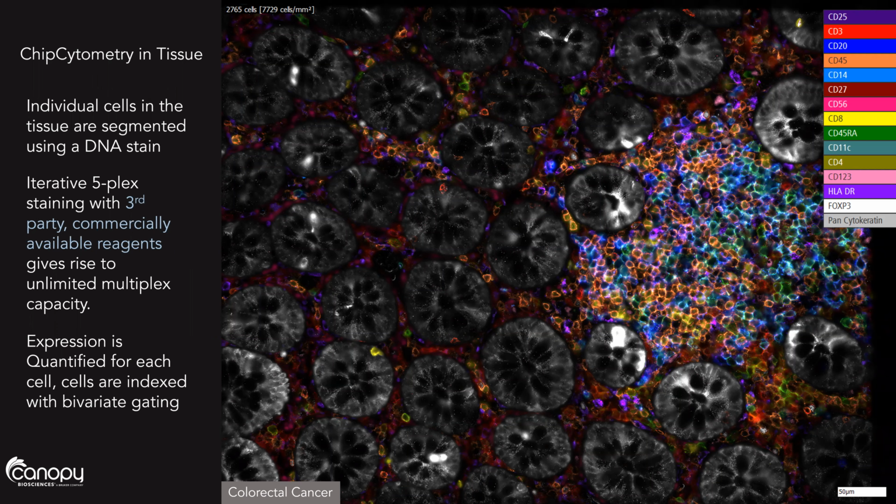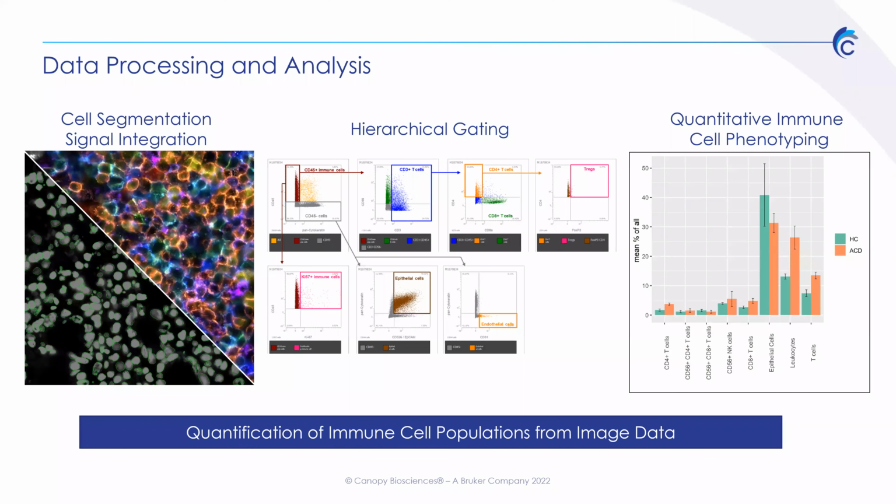The next half, after we've collected the data, is that we use cell segmentation and a DAPI signal in order to identify individual cells. Then we collate those signals. We have a very nice quantitative way of collating signals. We collate each of the signals that you've identified through your staining, and then we cast that at something that looks very much like a dot plot in flow cytometry. The analytical process, at least the one that's on board, is defining phenotypes and subphenotypes based on gating, so that in the end you end up with an identification of the cells that actually have that particular phenotype.